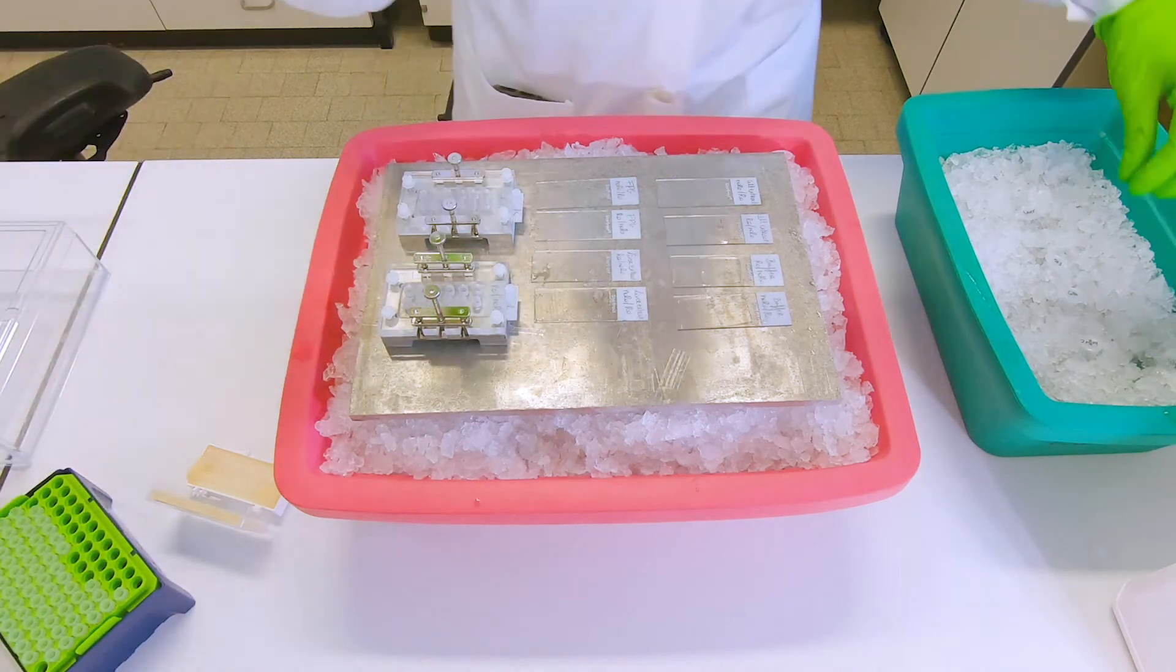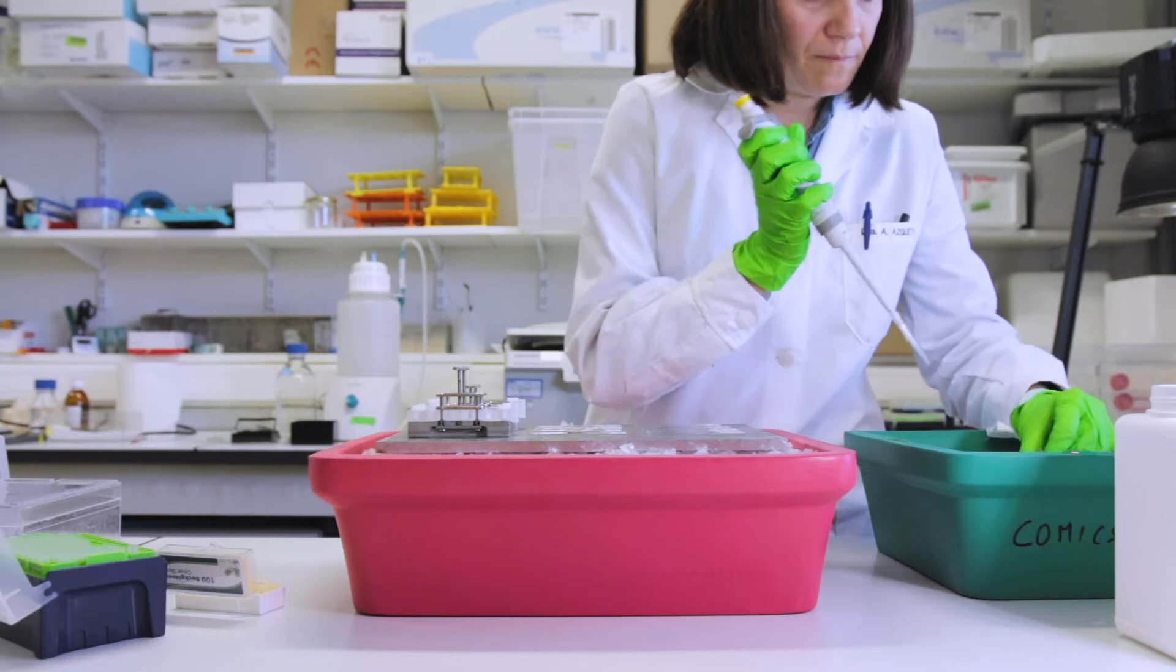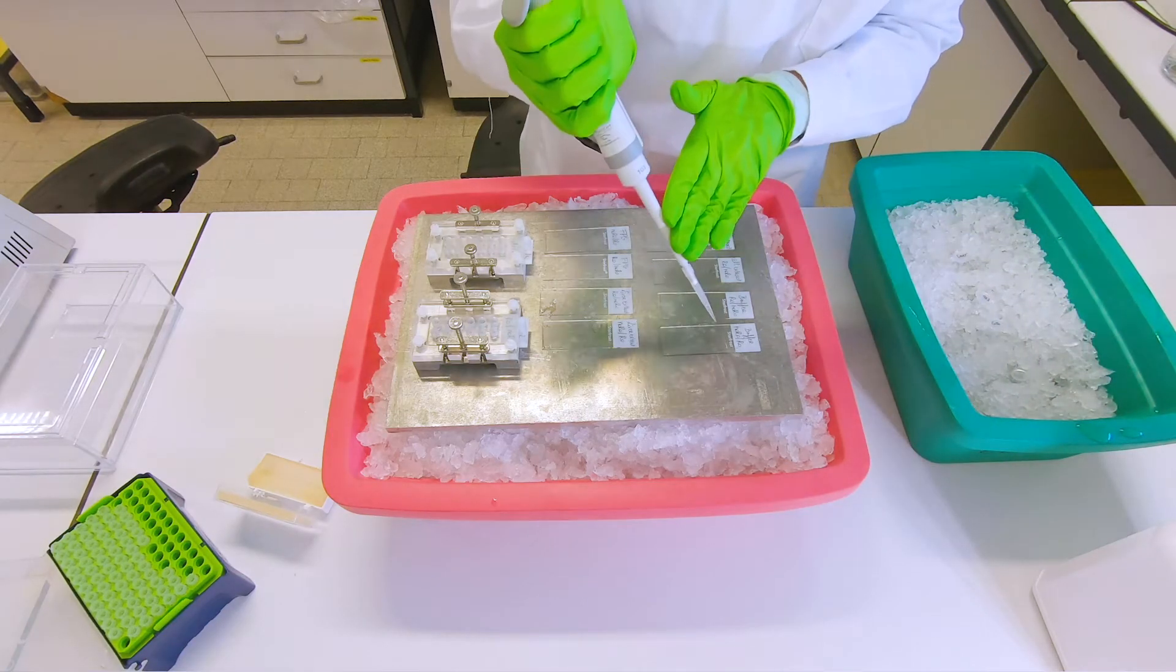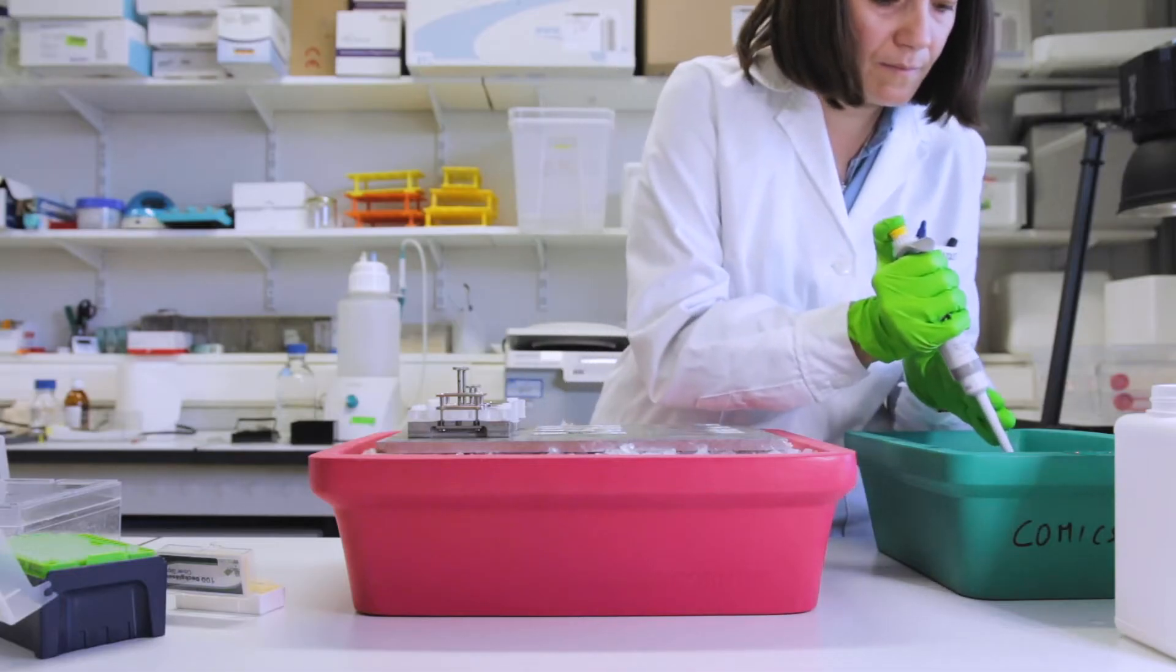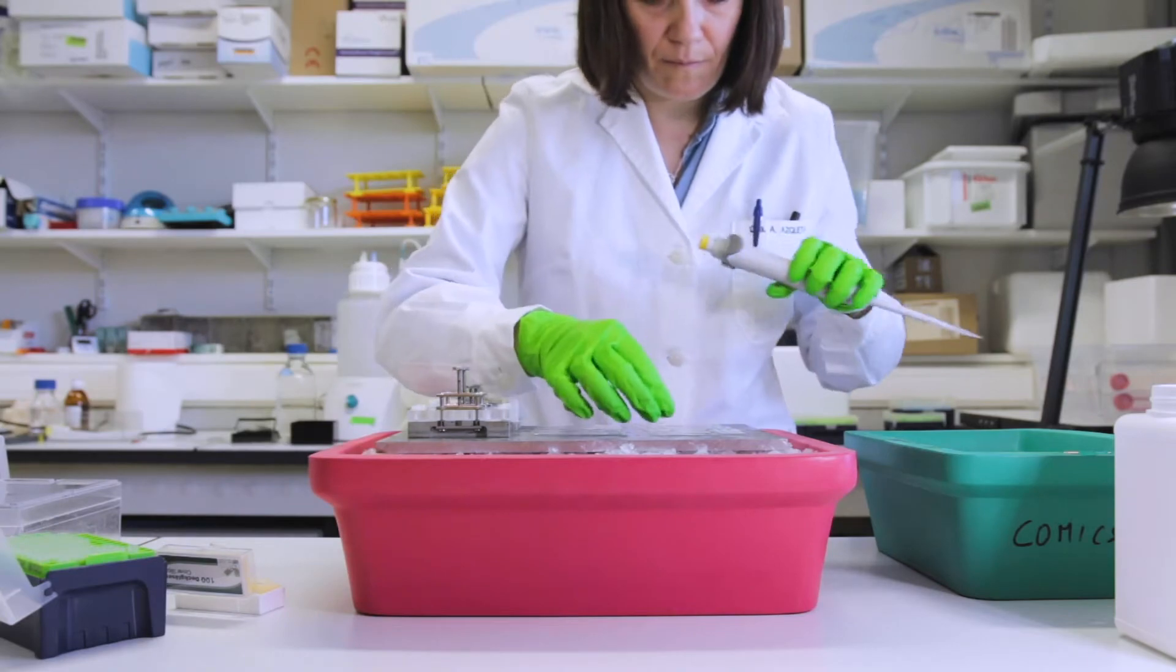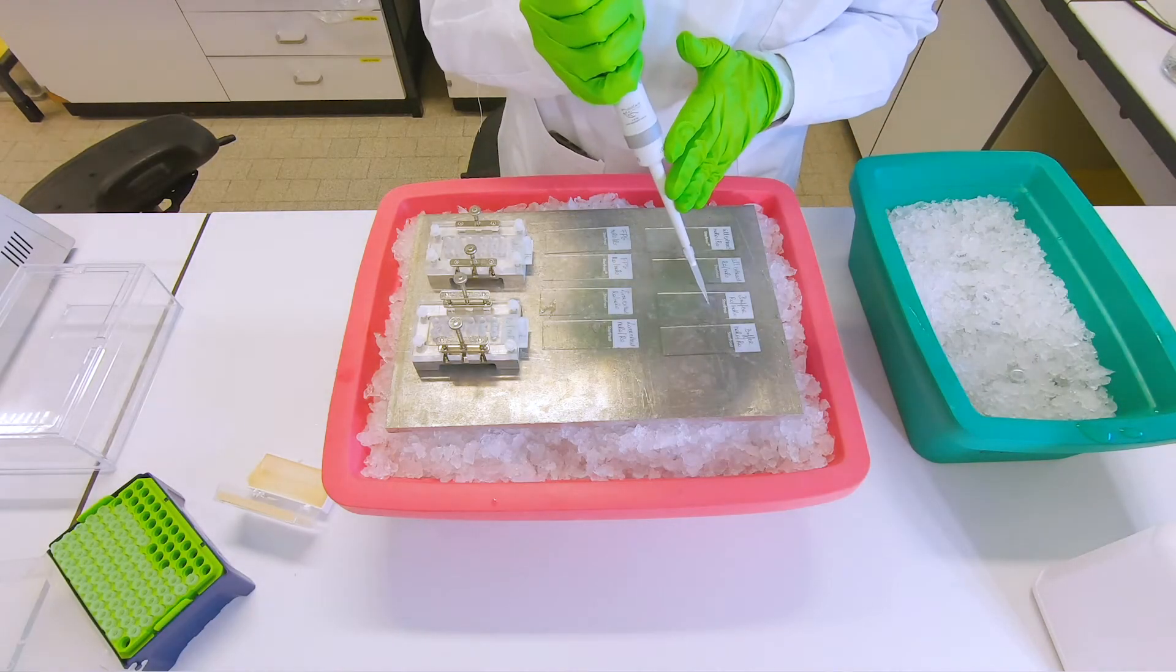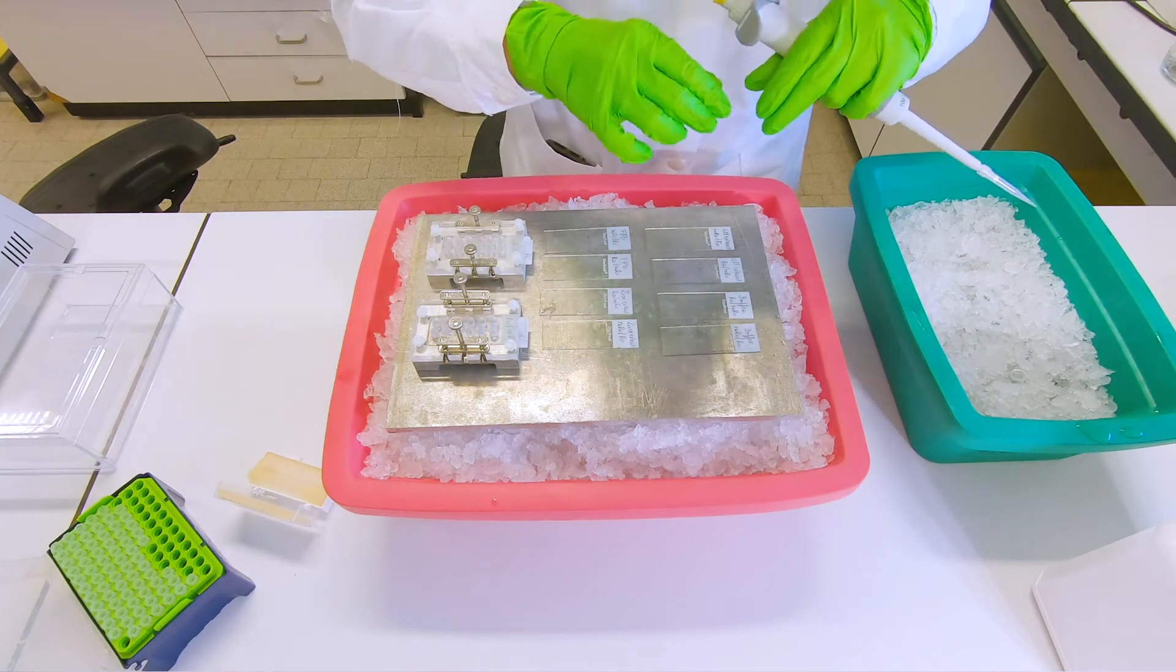On the two gels we put 50 microliters of the buffer control first on each gel, and then you cover both of these gels with one big cover slip. We advise this in order to prevent evaporation of the buffer or your extracts.